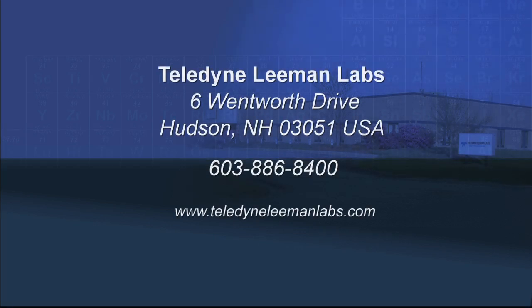For more information on the Hydra 2 AA Mercury Analyzer, contact our worldwide headquarters.